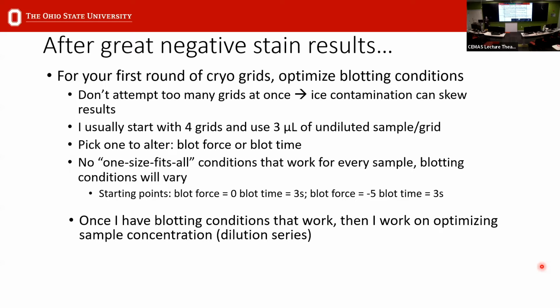So once you have some beautiful negative stain results, you know exactly what you're looking for in Cryo-EM. I spend the first round of cryo screening optimizing my blotting conditions. So when someone hands me a tube of protein and says, I want Cryo-EM data on this, the first thing I do is try to get my ice conditions just right.